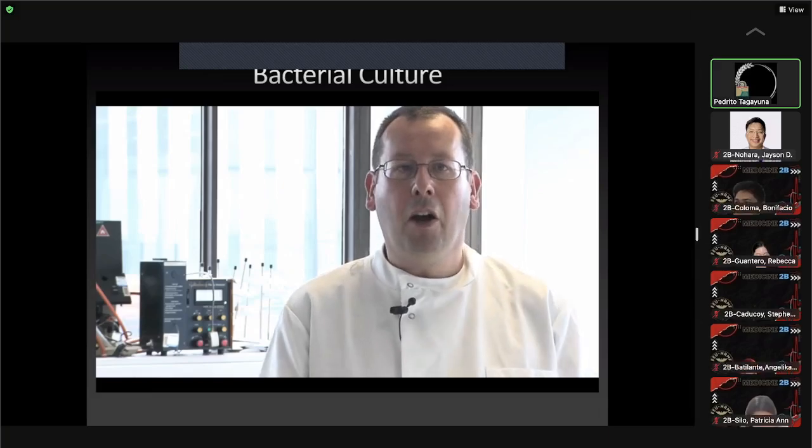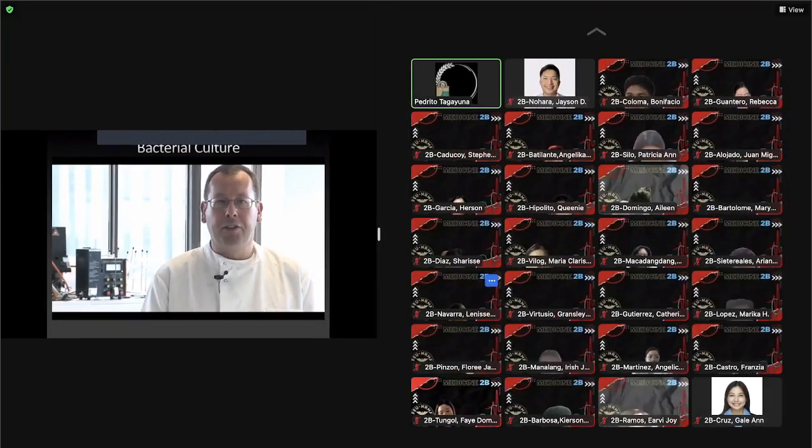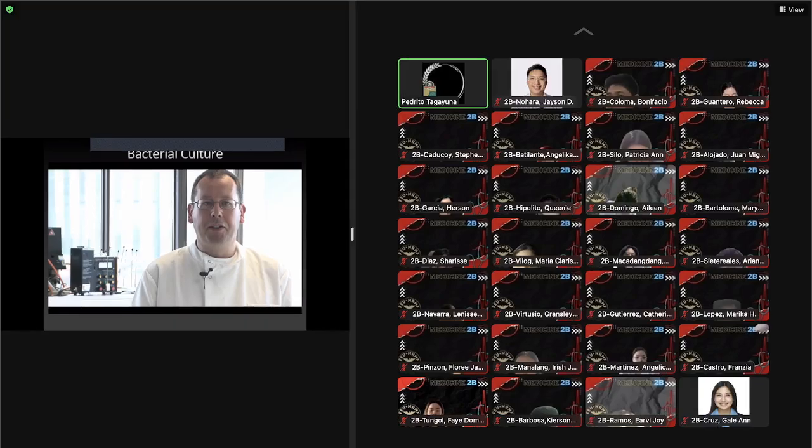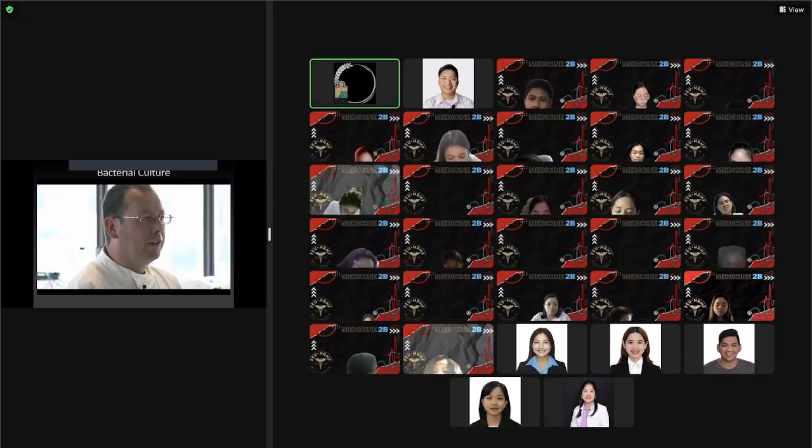There are hundreds of different types of media available, and the reason for this is that different species of bacteria and fungi will vary greatly in their nutritional requirements. And this is linked to the huge variety of metabolic pathways utilized by different species of microorganism.